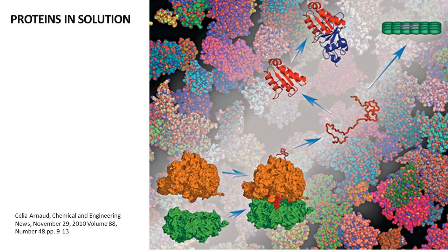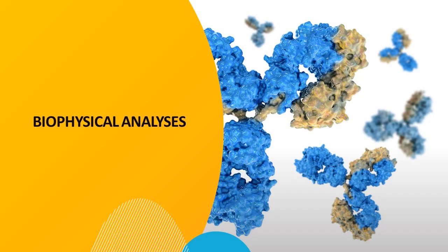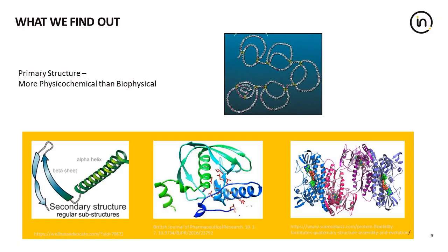This has massive implications, particularly in the pharmaceutical industry, where different formulations are tried to maximize protein activity and shelf life. If the conformation of a protein gets compromised, it might affect its stability and activity. And this is where biophysical analysis comes into the picture, because most of these techniques are non-invasive, in most cases anyway, and provide us with the relevant information that we need to know.